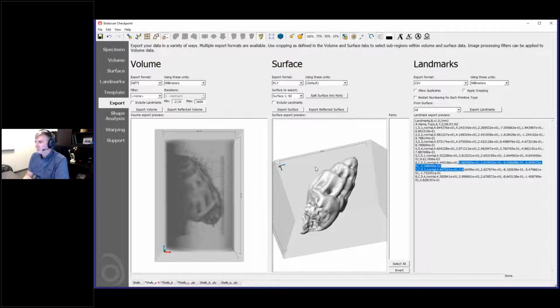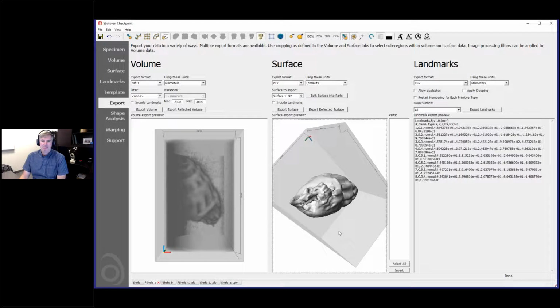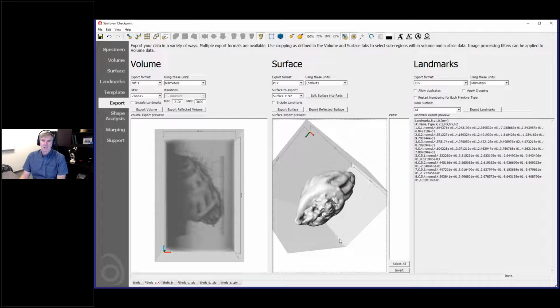And now that you have this curve and set of semi-landmarks that you care about, is there a way to make a default set of semi-landmarks for specific curves on multiple scans? Yeah, you can do that. You can set up templates to represent the set of points that you want, and place those onto your specimen.